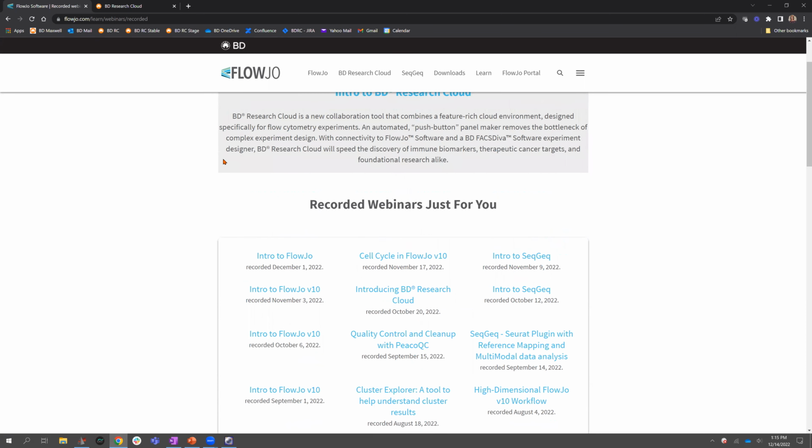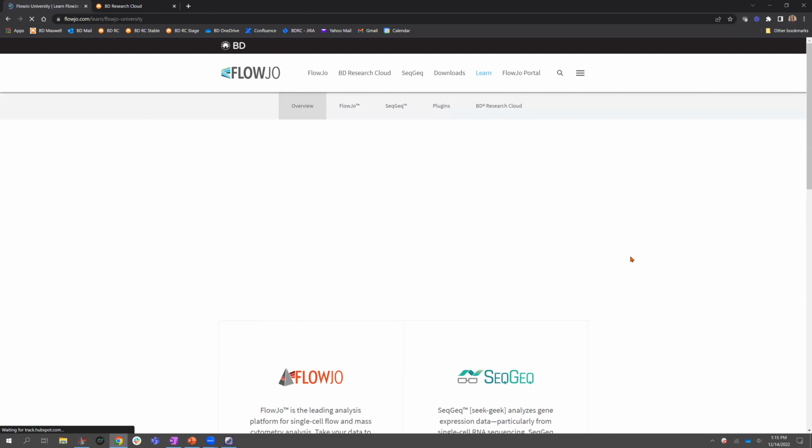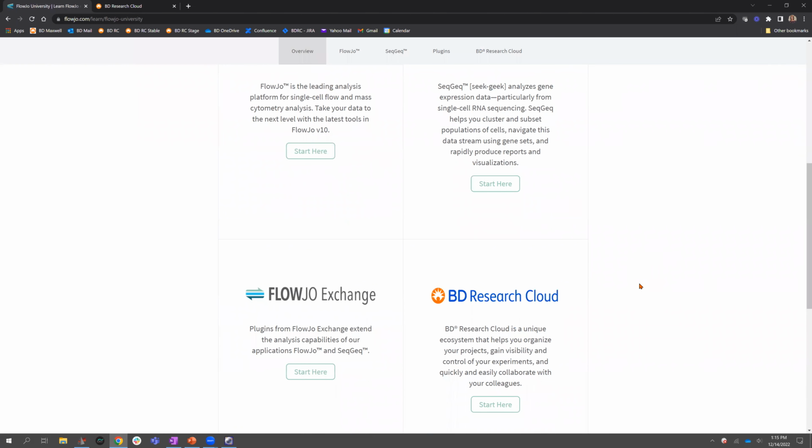Now, you can also learn a lot about the platform. Let's say you've watched the webinar, but you're still iffy on something that you learned and want to rewatch it. If you head over to the Learn tab and go to FlowJo University, these are going to be short videos, reminding you how to execute some of the functionality that we've gone over in today's webinar.